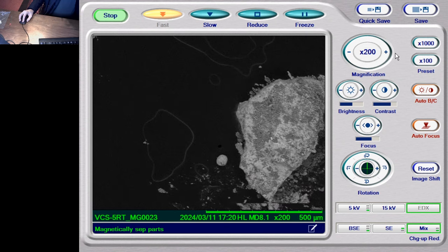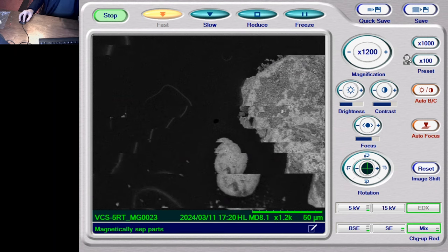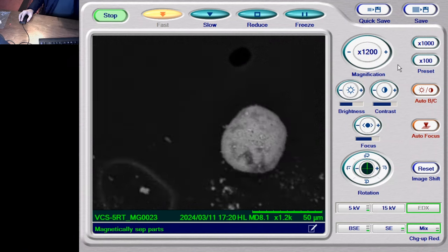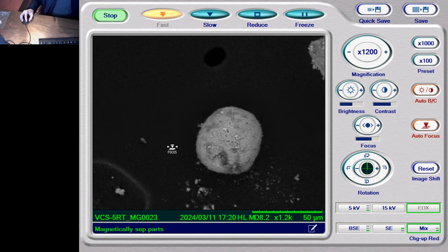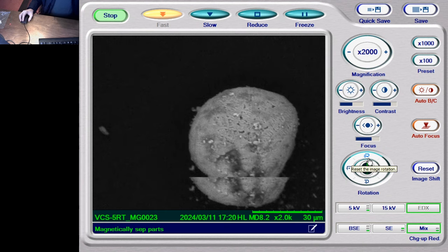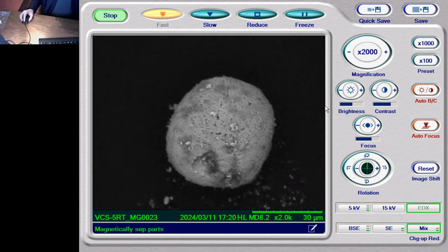This one probably is contaminated with chromium because it looks a little bit not so round. Less than perfect. Yeah, it looks like a contaminated one. Yeah, we've got the triangle hole cut out of it.